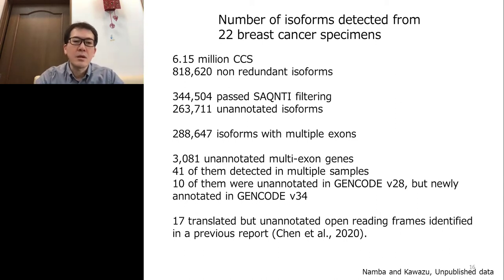So these data suggest that the MUSTA pipeline successfully captured the isoforms that are actually present but unannotated.